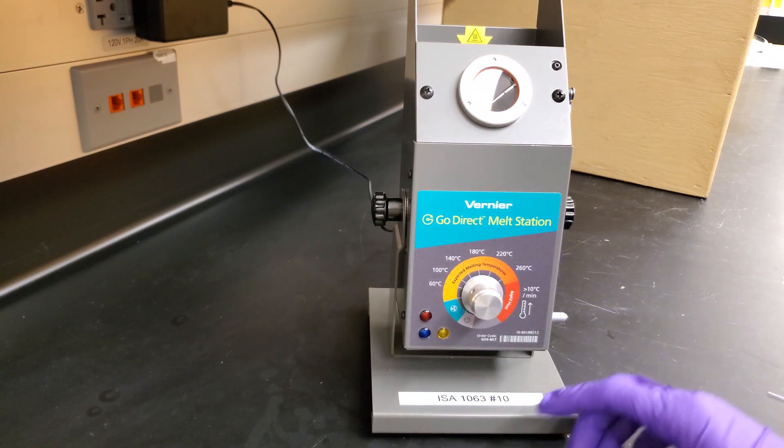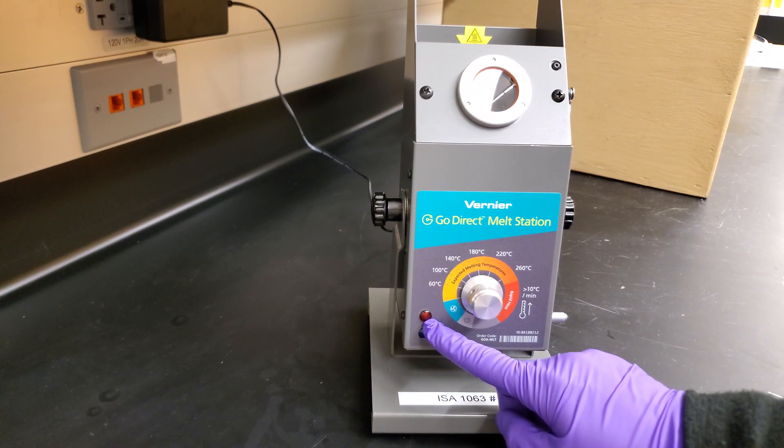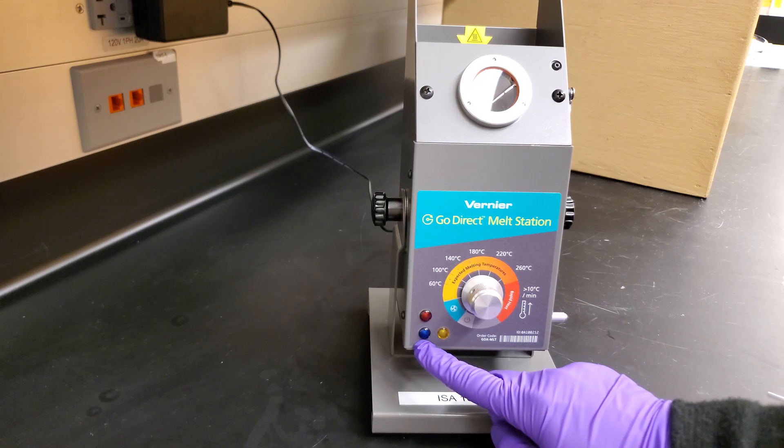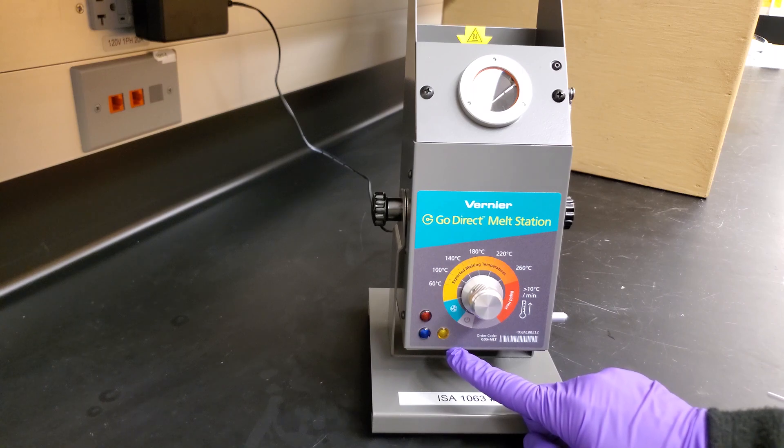On the front, there are three lights. The red light indicates it is in heating mode. The blue light indicates it's in cooling mode with a cooling fan running. And the yellow light is a safety shutoff.